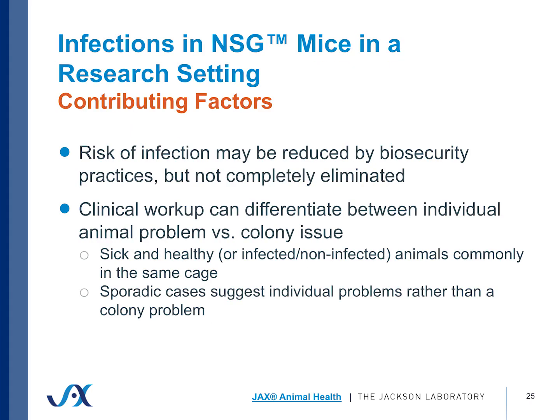The organisms that typically infect NSGs include the usual suspects of traditional pathogens and opportunists, but also commensal organisms. It's difficult to generalize about the conditions that contribute to these infections in NSG mice because we've observed them in nearly all barrier levels in our mouse facilities, from those with loose barrier conditions to those at the highest barrier levels. Problems are most often seen in mice that have been in the facility for a while. These are older mice that have been exposed to a bit more over time.